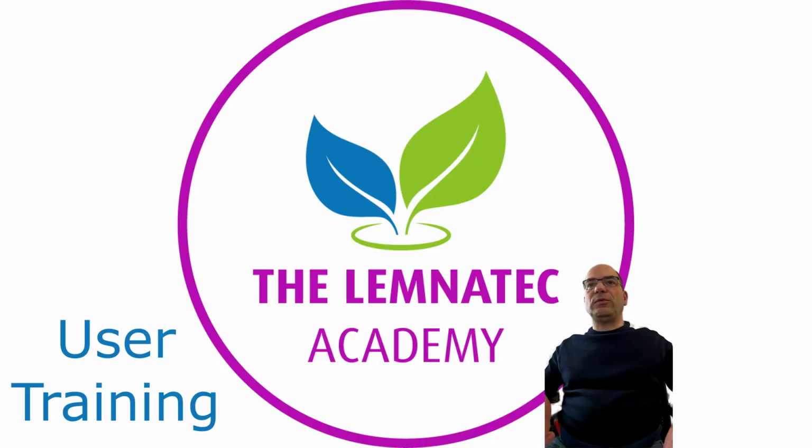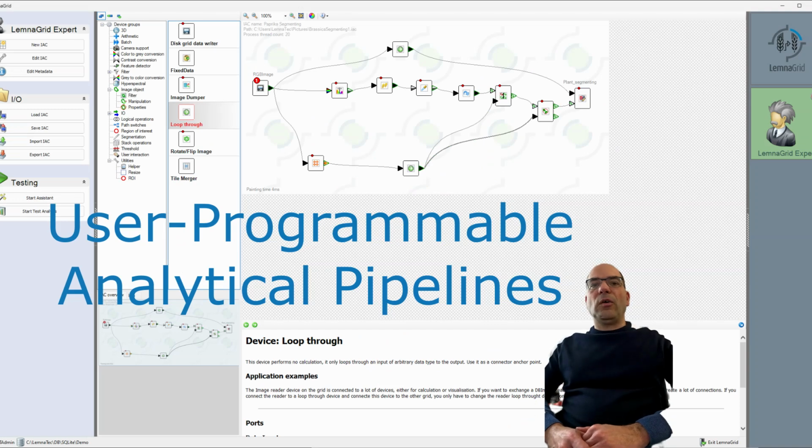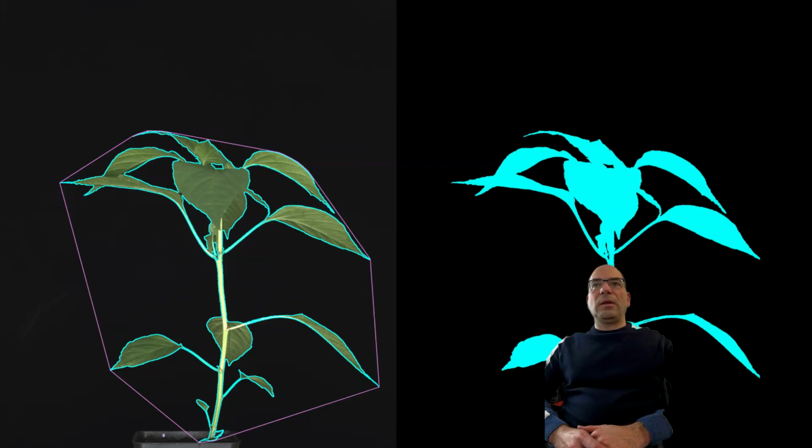Moreover, as soon as the system is delivered, the LemnaTec team provides an introductory training to you. This means we explain everything that you need to know, from sample preparation over image recording to image analysis and data processing and data download. Of course, you also get an introduction into the user programmable analytical software packages.